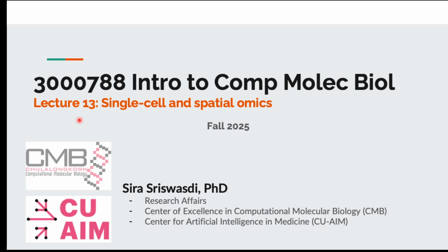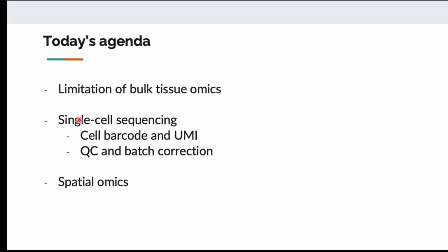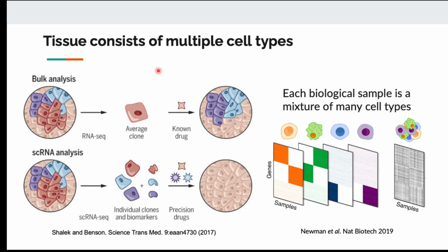So today we're going to focus on two techniques that will allow us to analyze omics data at higher resolution than just the bulk of the tissue. This will again be a two lecture series. Today we are going to focus on the omics techniques and some data processing. Next week we are going to talk about the detailed statistical model and the bioinformatic tools that we are going to use.